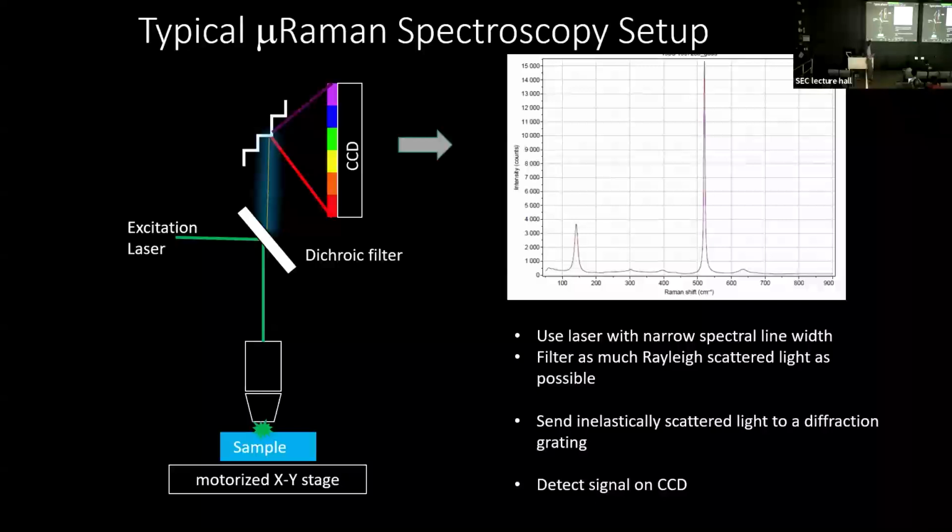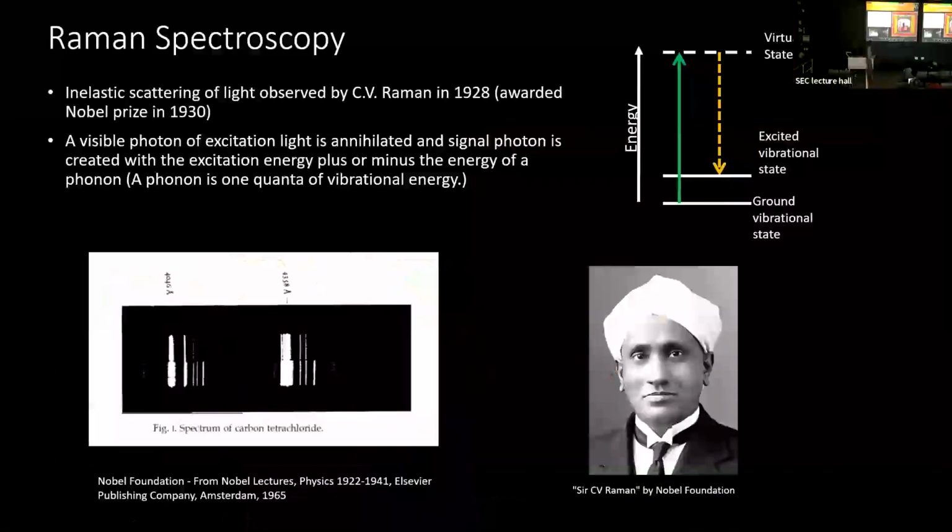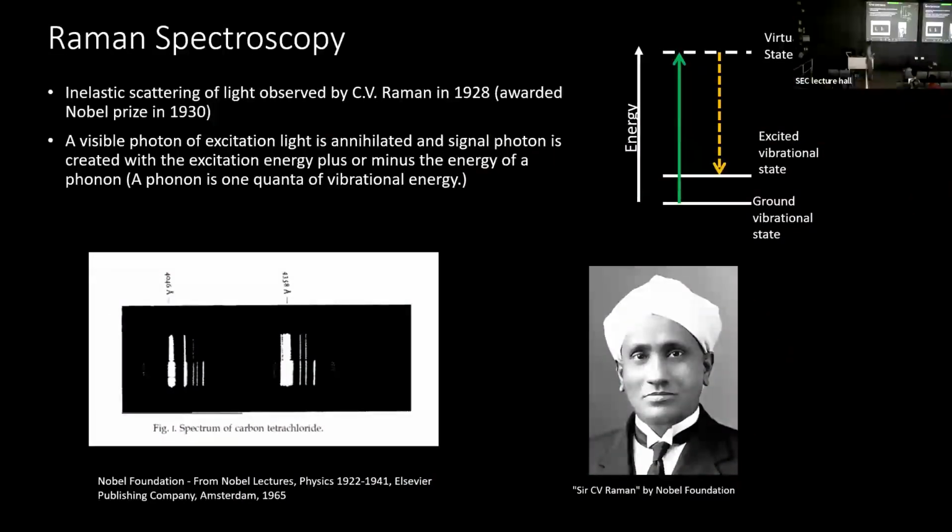So the mechanism for our signal is exciting the molecule to an excited vibrational state, with the energy being carried away by the phonon, and measuring that phonon energy level. And the phonon energy levels correlate directly to the molecular composition. Does that help?